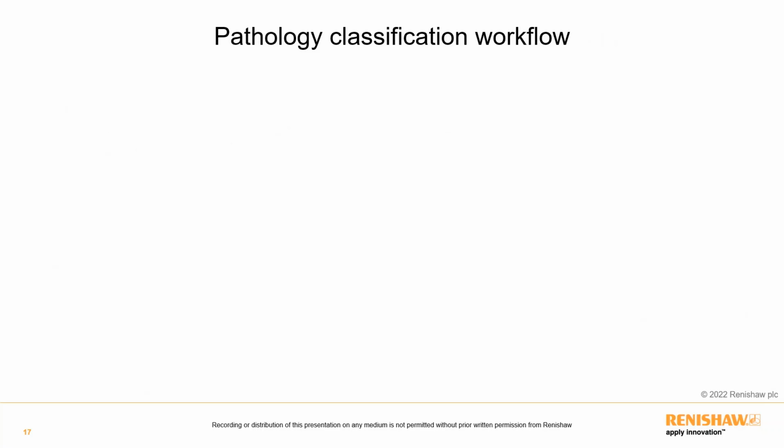So how do we go about using these systems for disease detection? Well, I'm now going to walk you through the workflow, which will demonstrate the 3 steps which will allow us to classify Raman data and determine if tissues or biofluids are diseased or not.